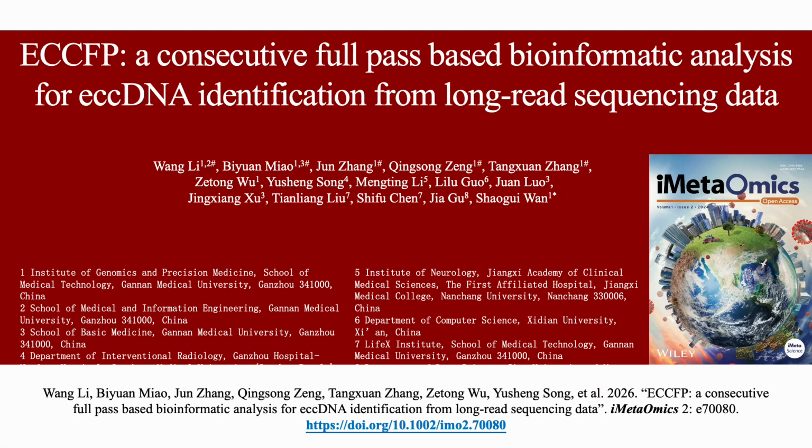Hello everyone. It is a great honor to share a study from Dr. Shaogui Wan's group at the Gannan Medical University. This study introduces a bioinformatics pipeline, named ECCFP, for eccDNA identification from long-read sequencing data.